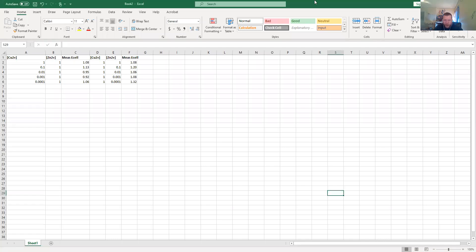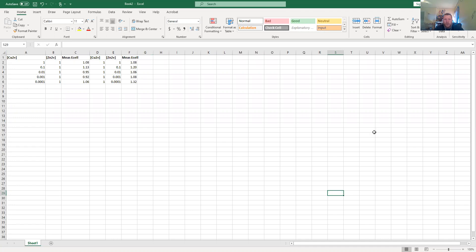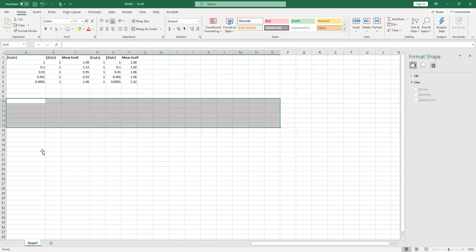What I'm going to show you is how to generate the graphs you need for this electrochemistry lab. You need to produce a total of two different graphs: your measured electrical cell potential versus the log of your copper concentration, and then measured cell potential versus the log of your zinc concentration.